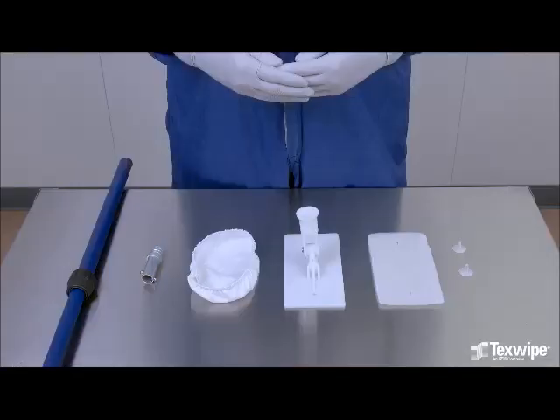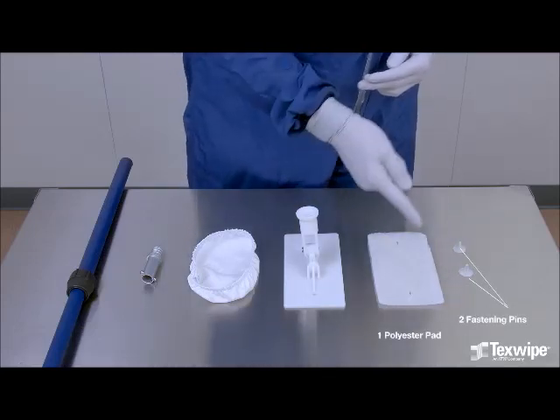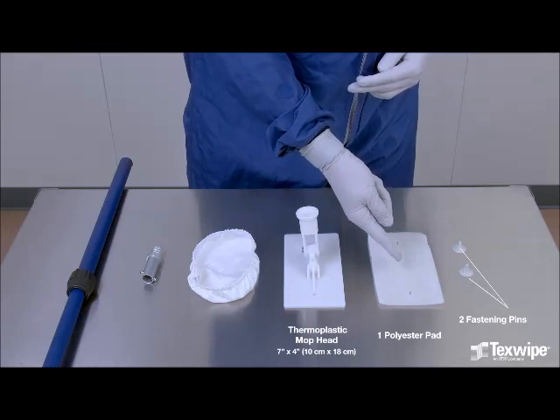The Isolator Cleaning Tool Mini Alpha Mop consists of two fastening pins, one polyester pad, and a thermoplastic mop head.